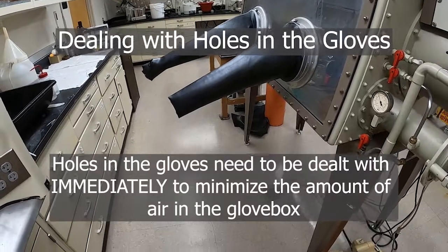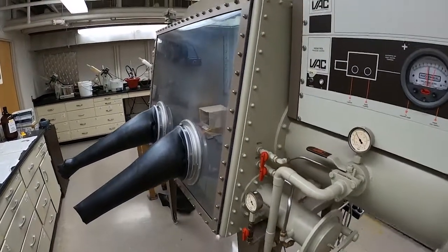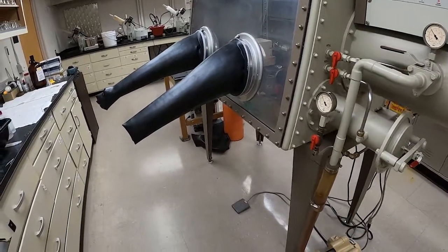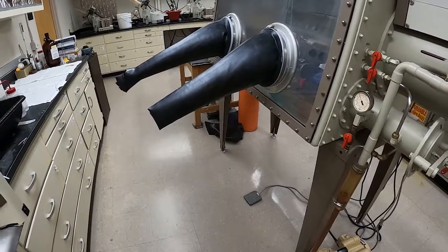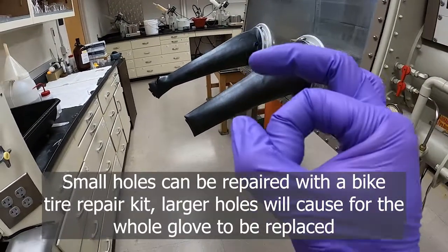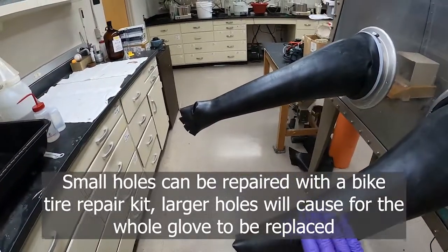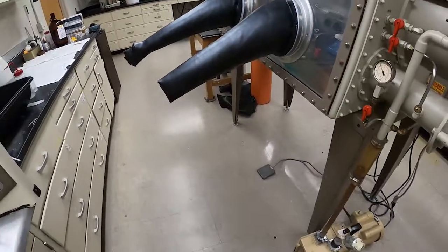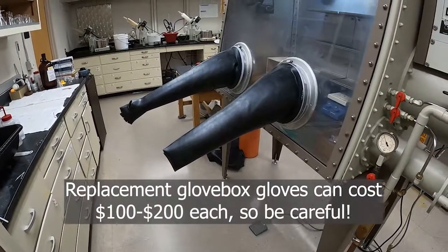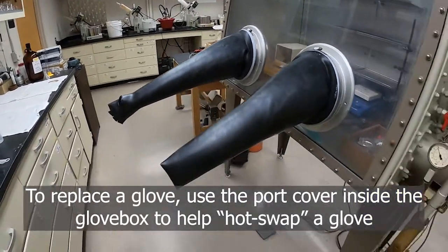If you do poke a hole in the gloves, be sure to tell someone so it can be repaired immediately. It's much worse to let a hole sit in the gloves and allow the glovebox atmosphere to be spoiled — potentially ruining valuable reagents stored inside — than to be the one who caused the hole. Small holes can be patched with little bike-tire patch kits: rough up the surface around the hole and apply the glue. If you have a larger hole, you'll probably need assistance to replace the glove; there are covers for the glove holes in the meantime.